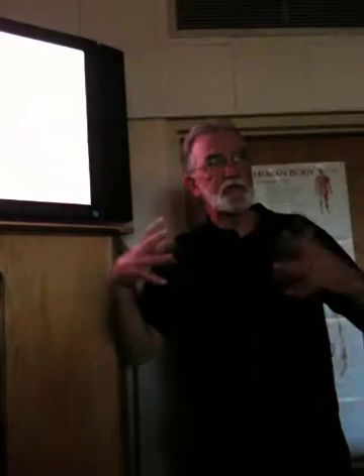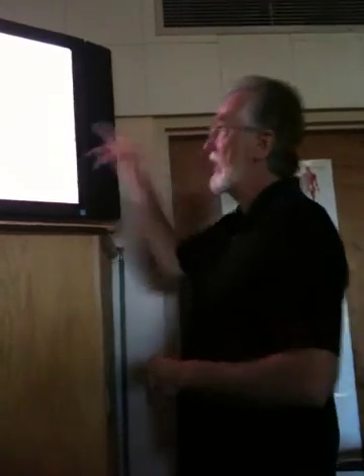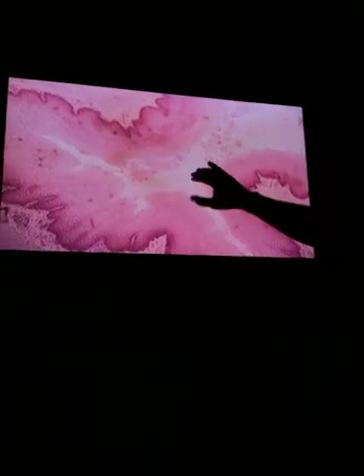When the food comes down from the oropharynx and into here, this would start expanding out with the food, and depending on the size of the bolus you took, if you took too much, it can only expand so much and you start getting some choking issues. But this is all stratified squamous. Whenever you see anything that's in a circle with an opening in the center, it's going to be the esophagus. We'll take a look at these again and again. Just want to run through some of these now. Now we get into the stomach.